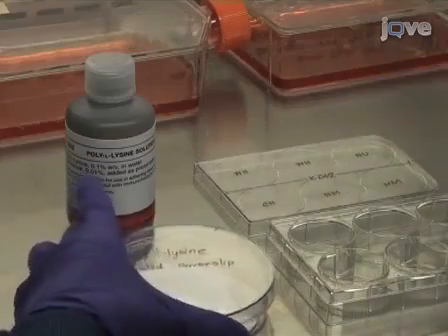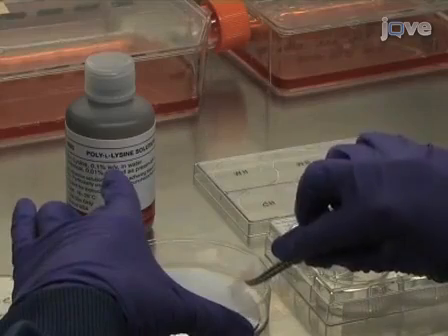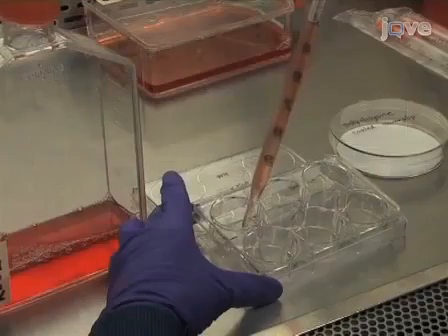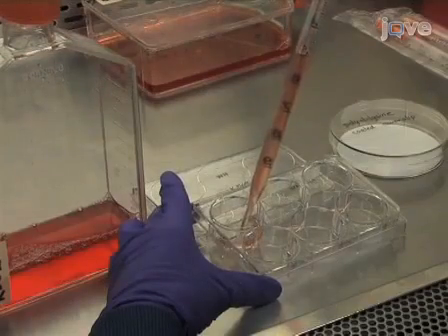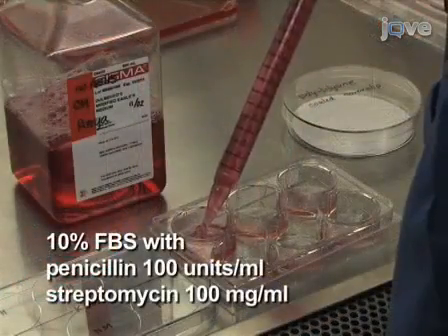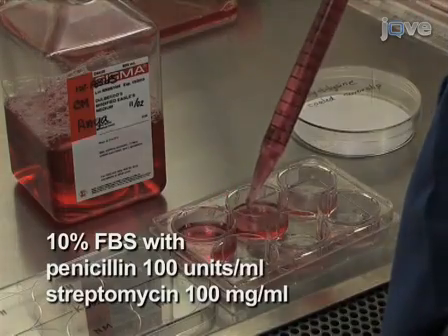To attach non-adherent cells, place a poly-L lysine coated cover slip in a well of a 6-well plate with the coated surface facing up. Seed K562 cells at a density of 7x10 to the 5 cells per well in Dulbecco's Modified Eagle's Medium, supplemented with 10% fetal bovine serum and penicillin streptomycin.